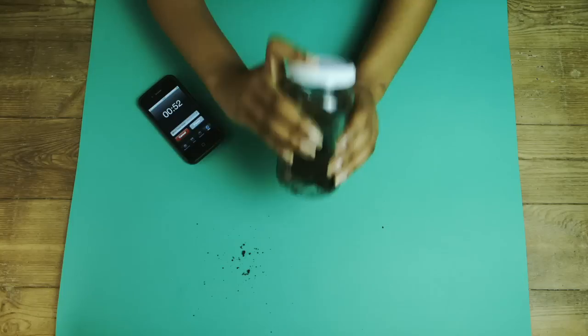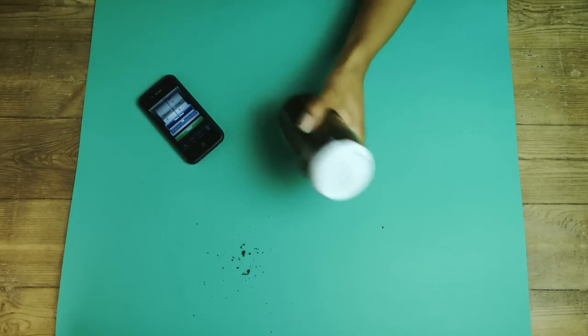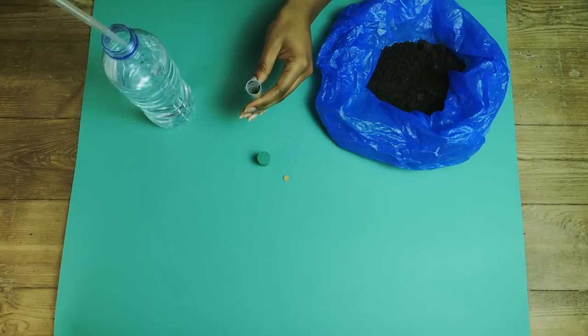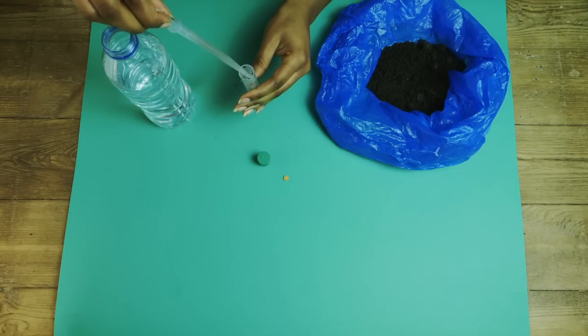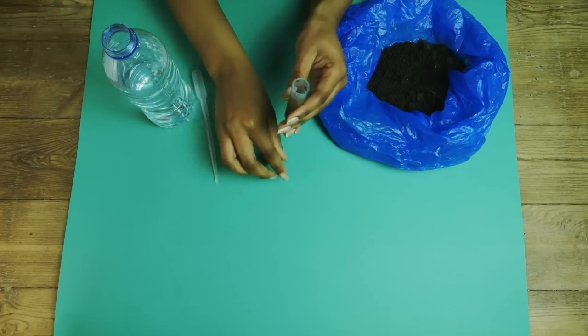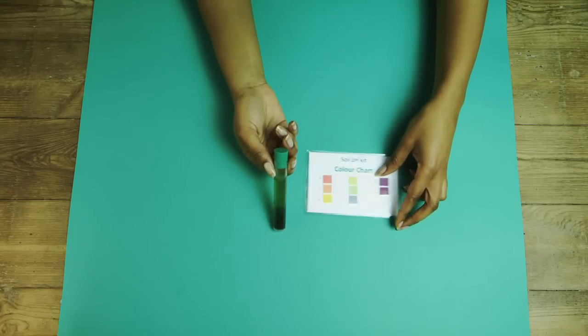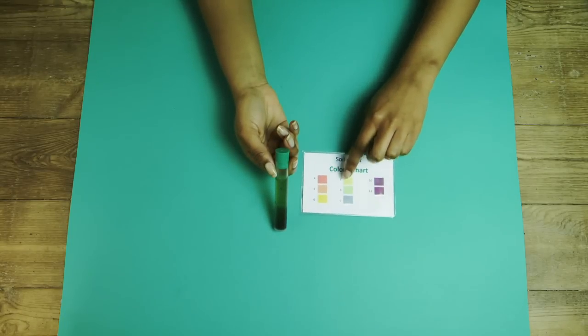Put the lid on and shake it, baby, shake it for about a minute and then put it aside to let the soil settle. Using the pipette, fill the pH test tube with some more of your tap water and add 1 teaspoon of soil. Add a pH test tablet, put the cap on and shake even harder this time. Once the soil is settled, compare the colour of the water to the pH colour chart.